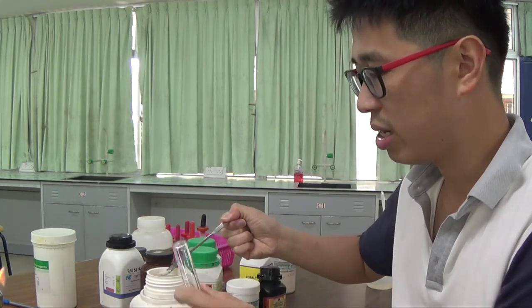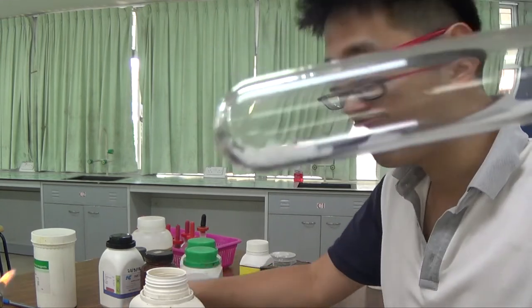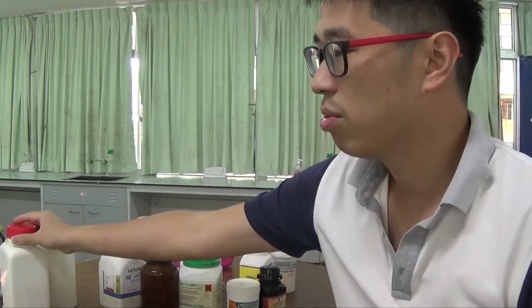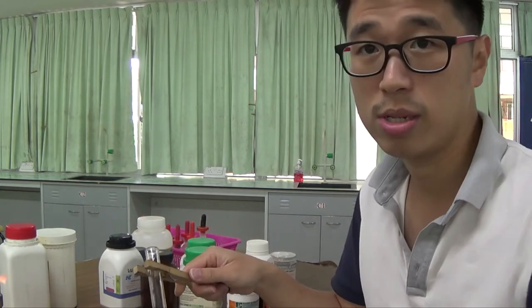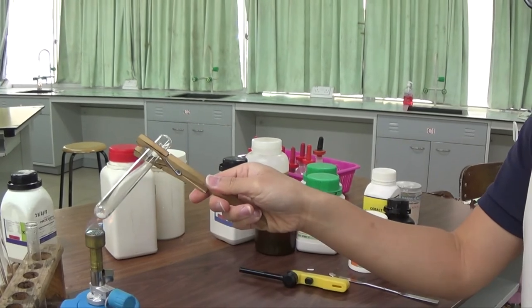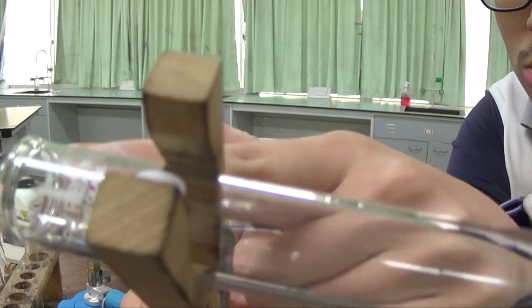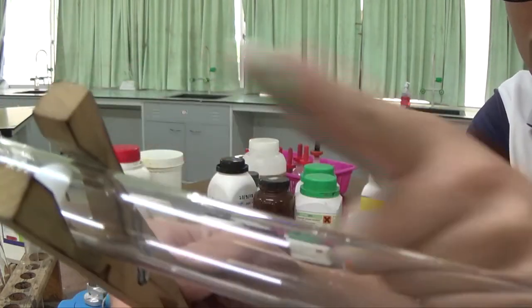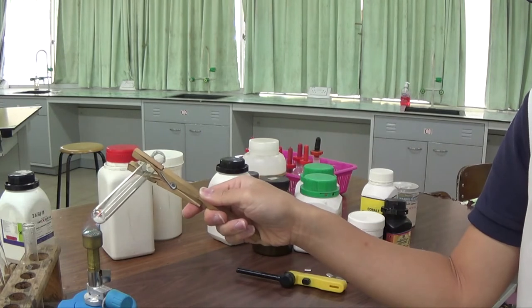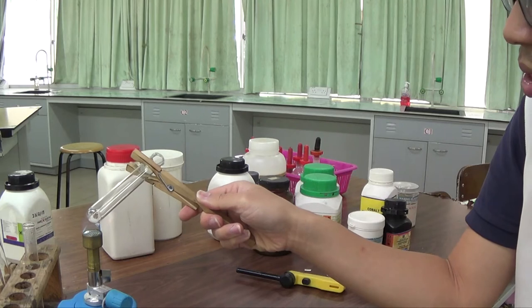So this is the zinc sulfate hydrated. It's also very crystalline. So what are we going to see here? It's probably similar. Okay, so let's have a look. My test tube is clean and dry, okay? Clean and dry. No water at all, no liquid, sorry. You can't tell it's water, but you suspect it's water because it's a colorless liquid that comes from heating a solid.